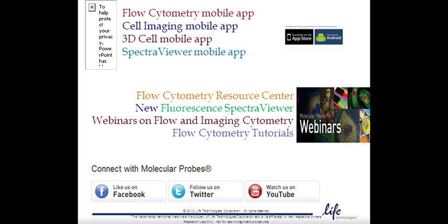The side population technique, for those of you who don't know, identifies stem cells and early progenitor cells in hematopoietic tissues. The DyeCycle Violet or Hoechst is loaded into your population of interest, and these cells subsequently pump out the dye with a membrane pump-dependent mechanism, and this results in a tail called the side population.